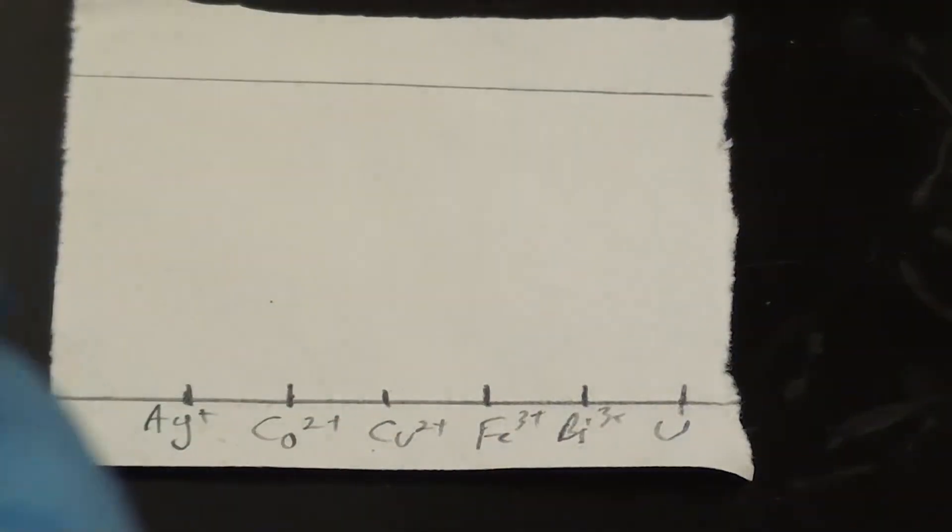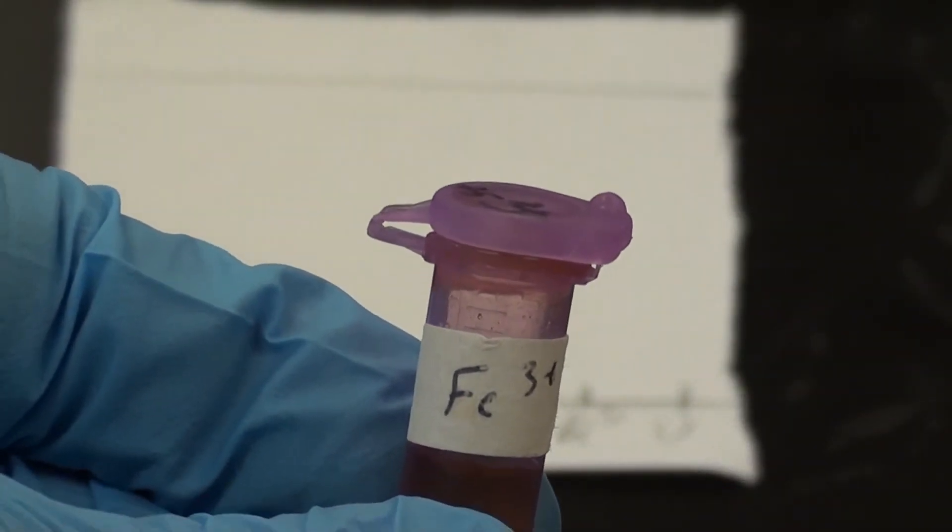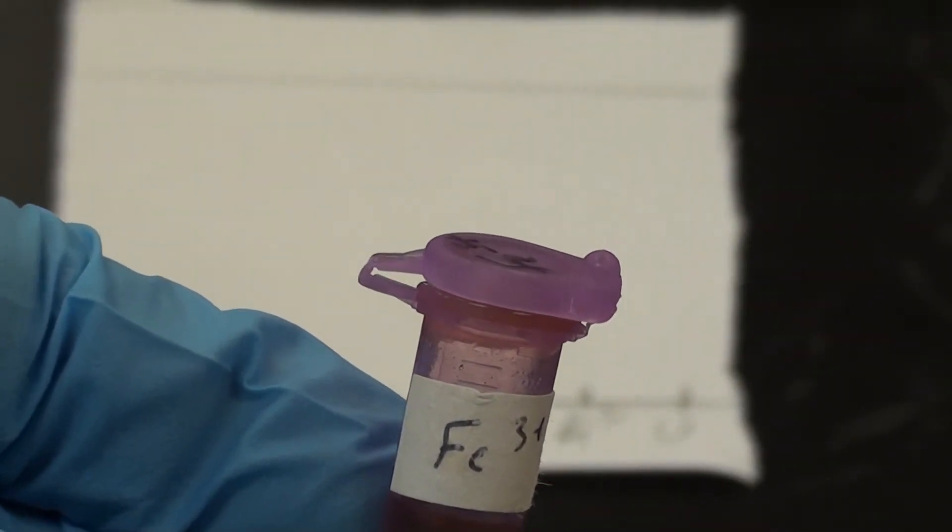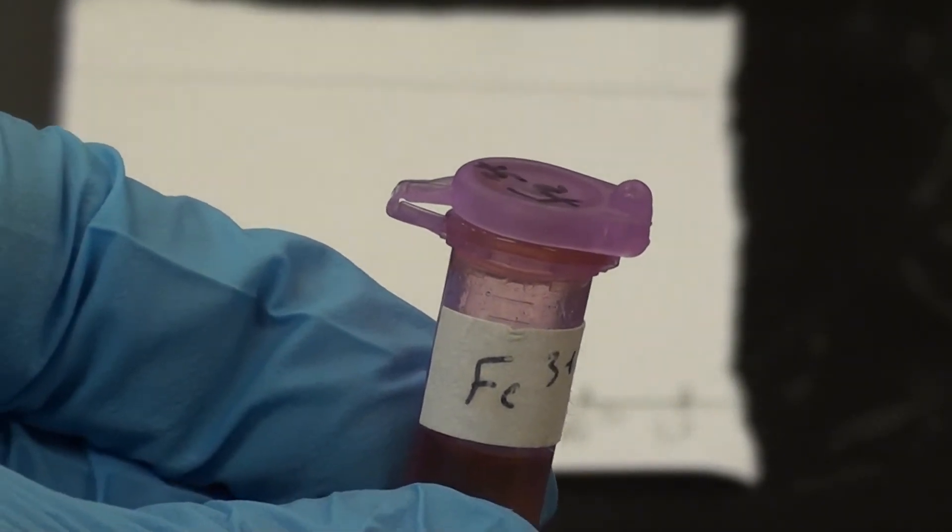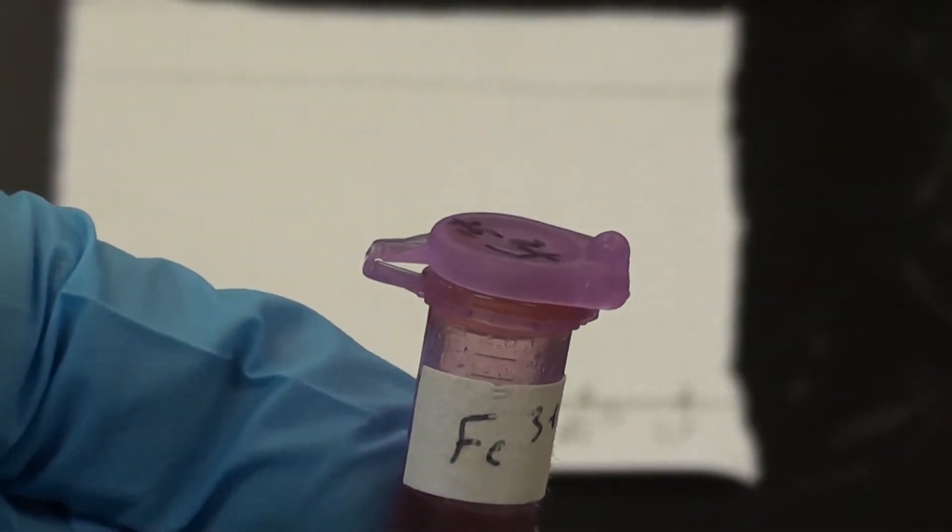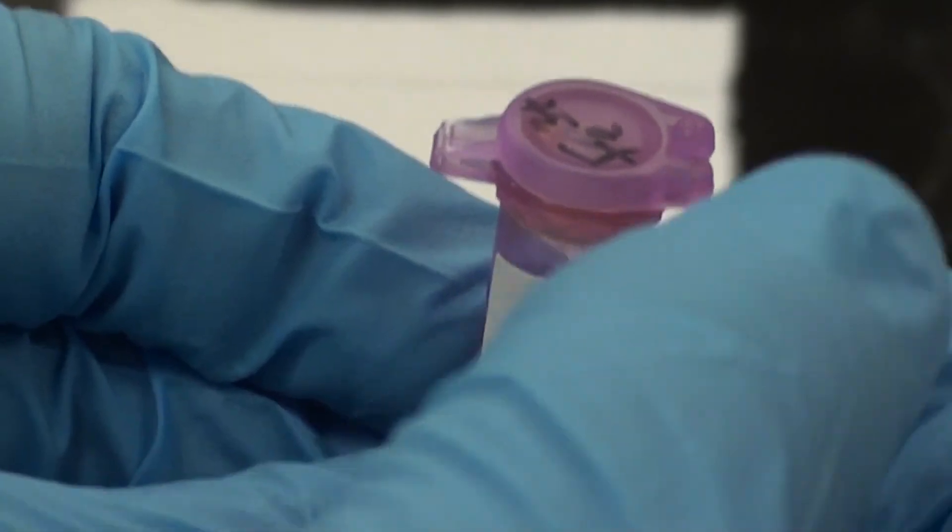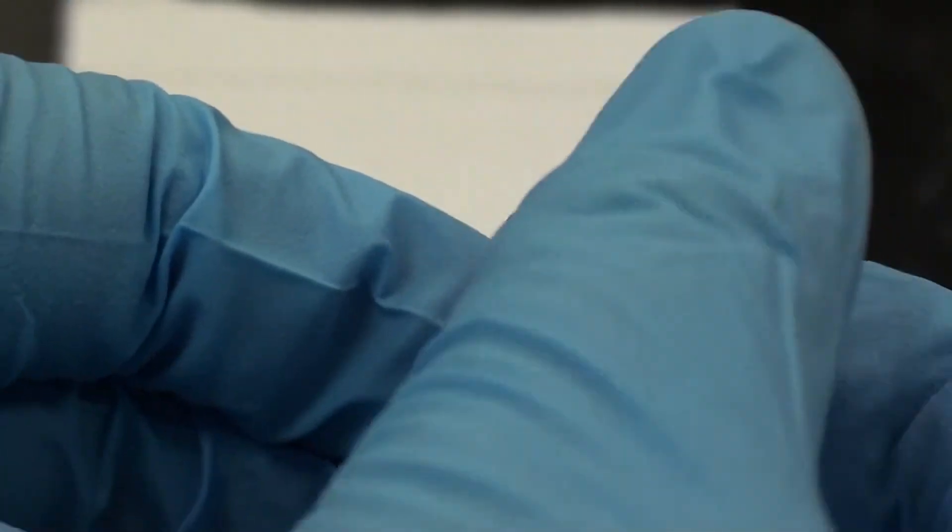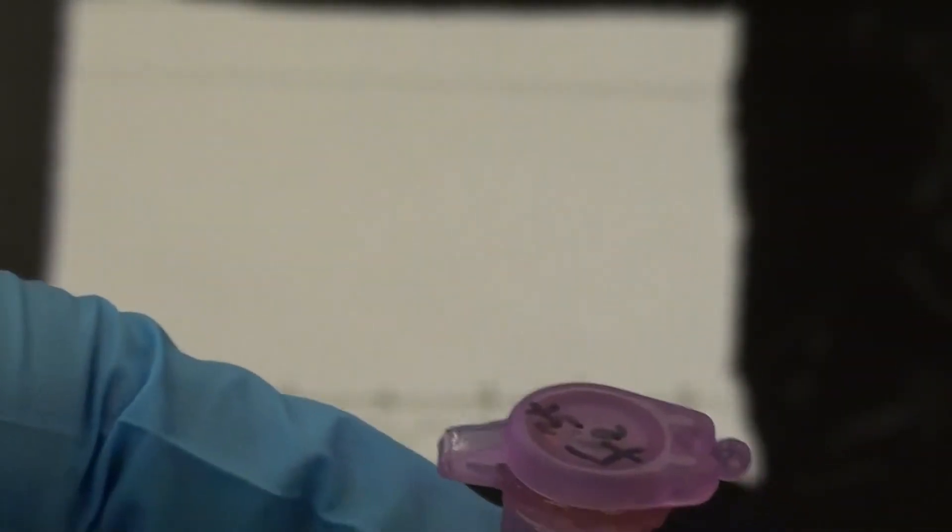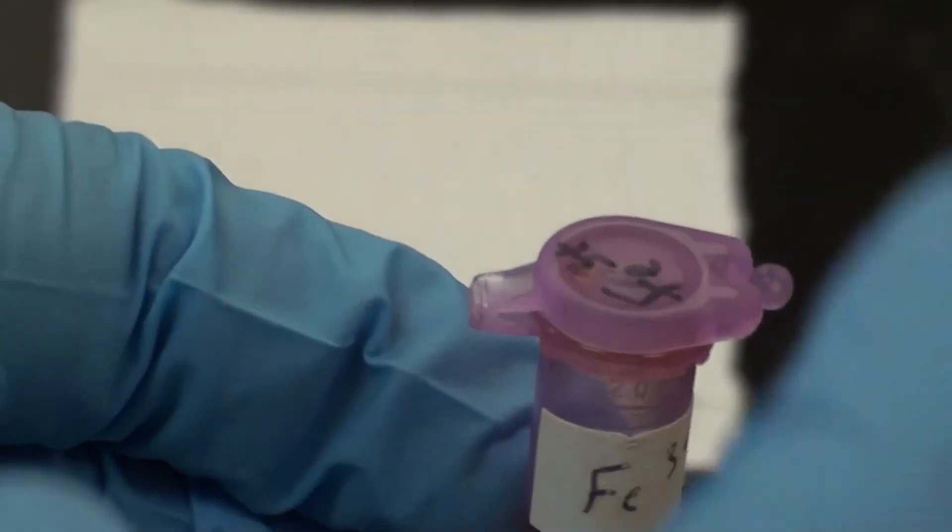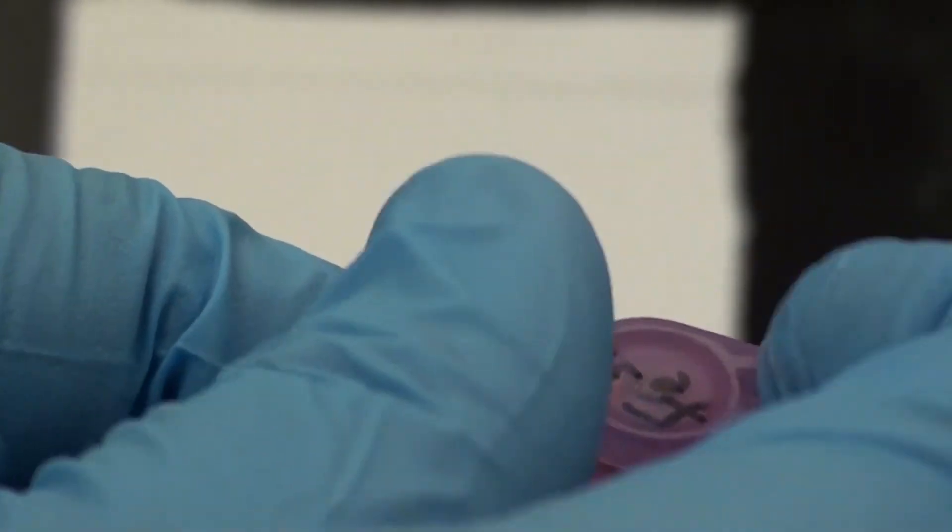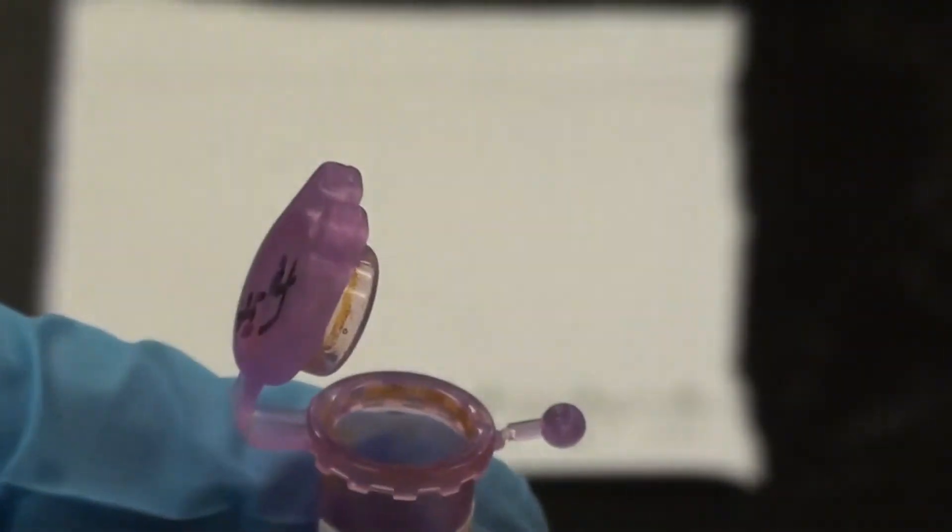There is another kind though, and that's this kind here. And what I want you to see, it has this little ball assemblage in a notch. And the way you open those is to flick the ball down and then to flip the top open. I'm going to try and show you how to do that. It might be a little hard to see with my thumb in the way. But what I did just now was I just flicked that ball down, you can see it's no longer in the notch. Just flick that down here and then the whole thing can be opened up.